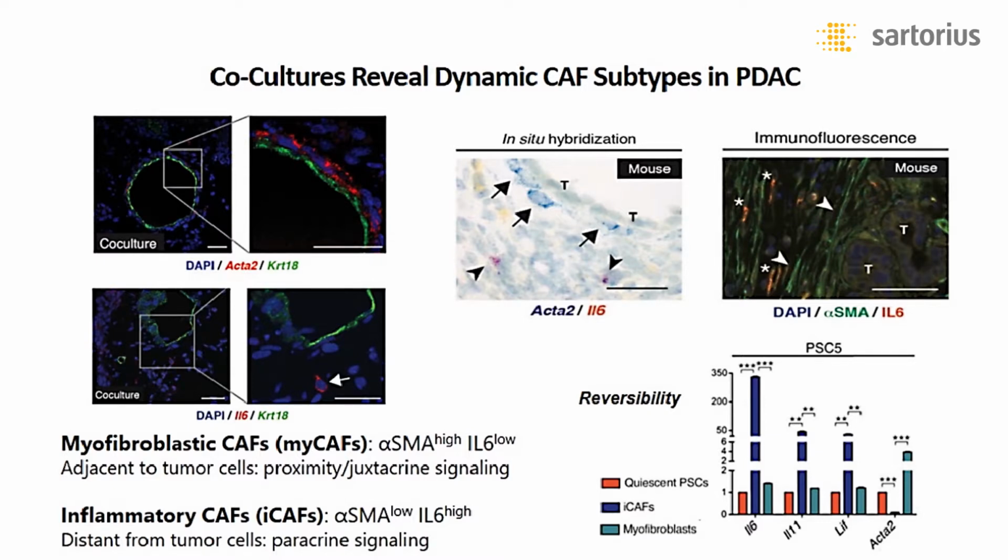By in situ, the probe is picking up alpha smooth muscle actin. Now, above those cells, you see a bunch of blue DAPI-stained cells. Those are actually the stellate cells we started with, but they don't express smooth muscle actin. So what do they express? On the two little micrographs below it, you see that there's now some cells that express IL-6. And this is actually a stellate cell that's starting to make cytokines and chemokines, and IL-6 is one of them.